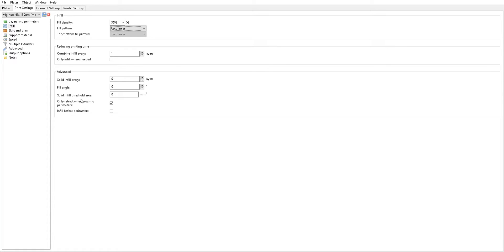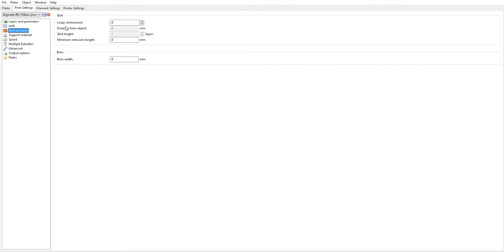Everything else here pretty much stays the same. You want to make sure that you have your retract when crossing perimeters option checked. This is kind of going back to what I was saying of wanting to reduce any messiness between perimeters or traveling. This is kind of like retraction whenever you're moving around perimeters. So it's just good to have.